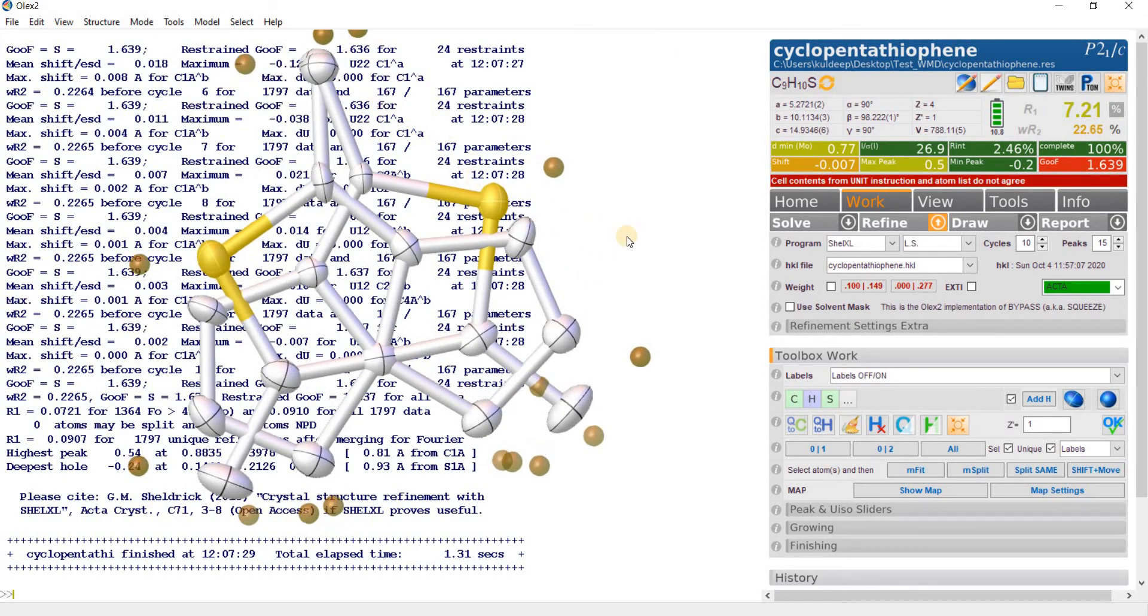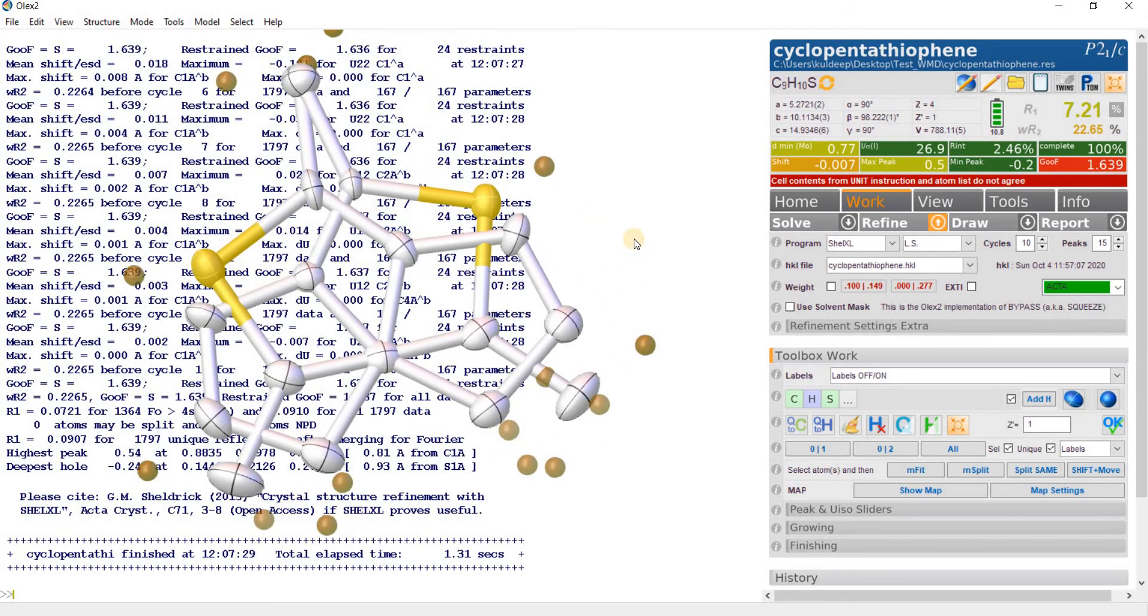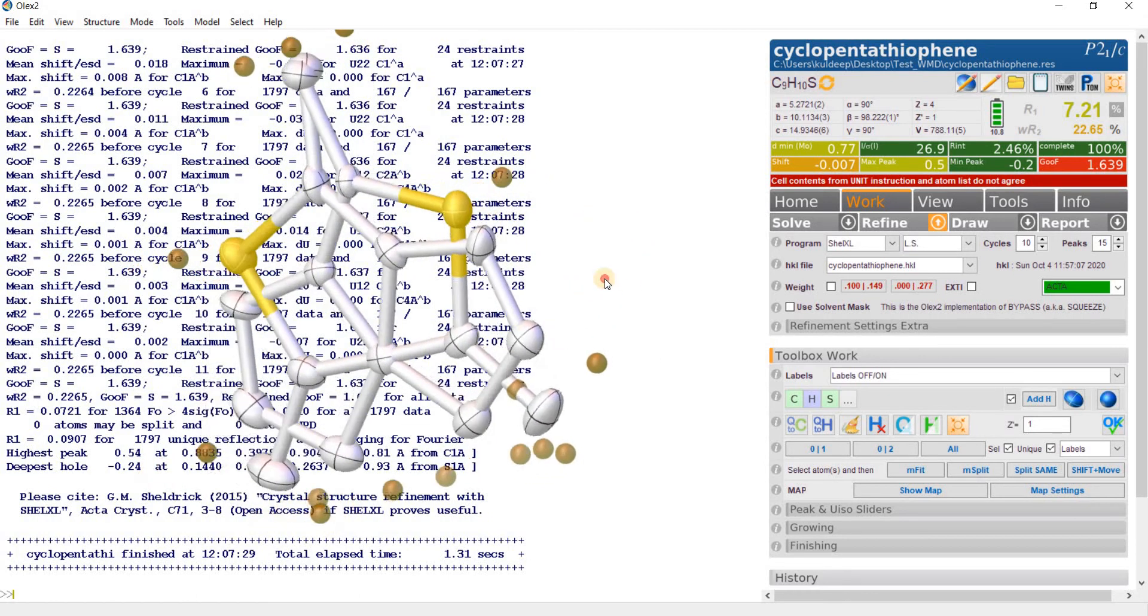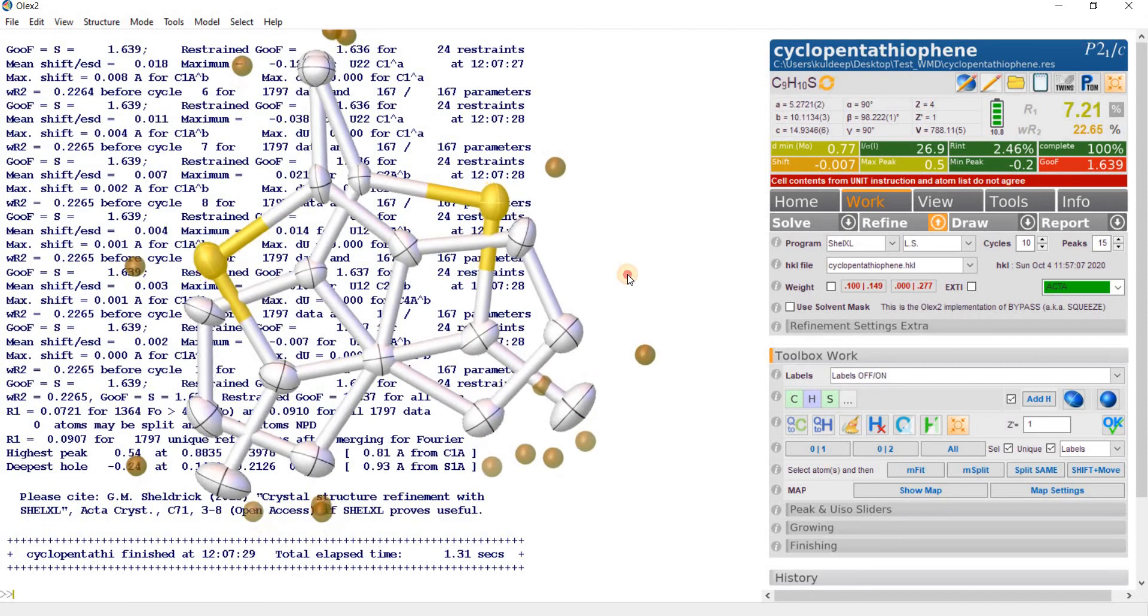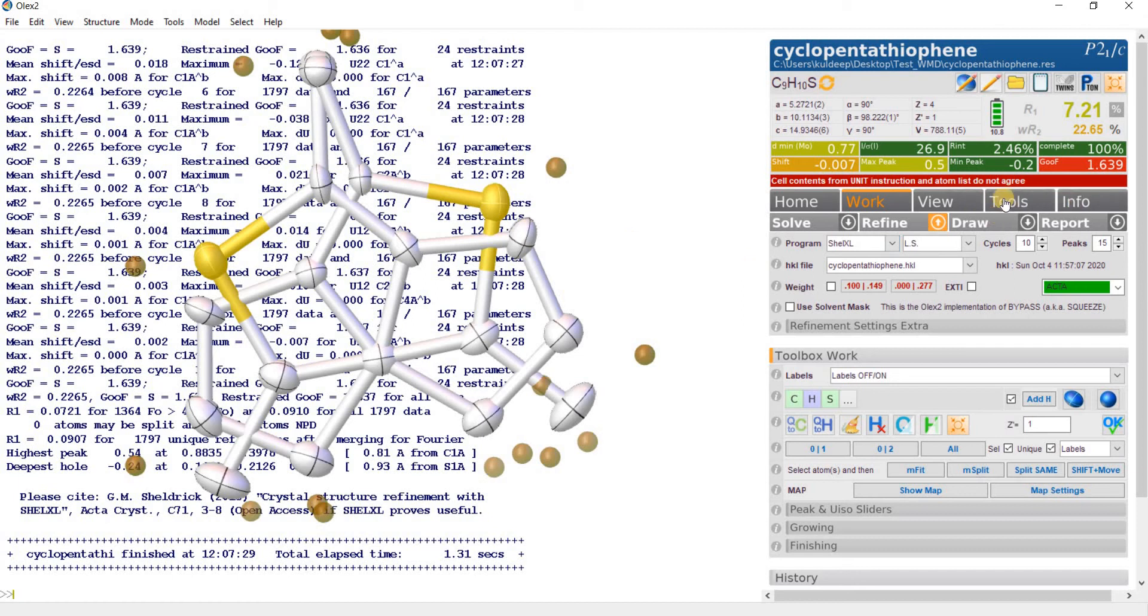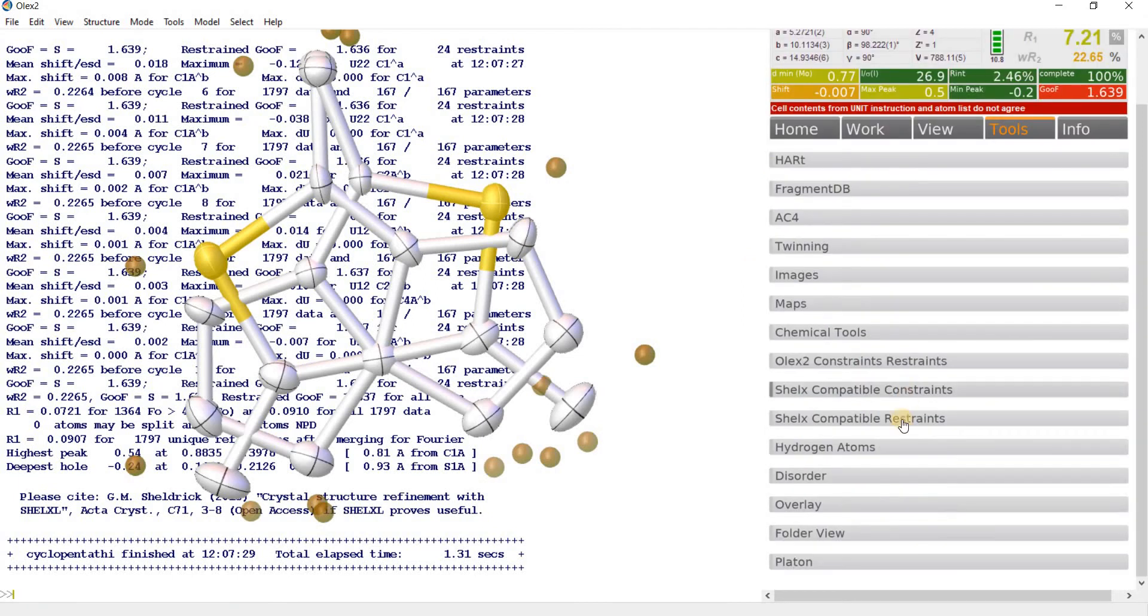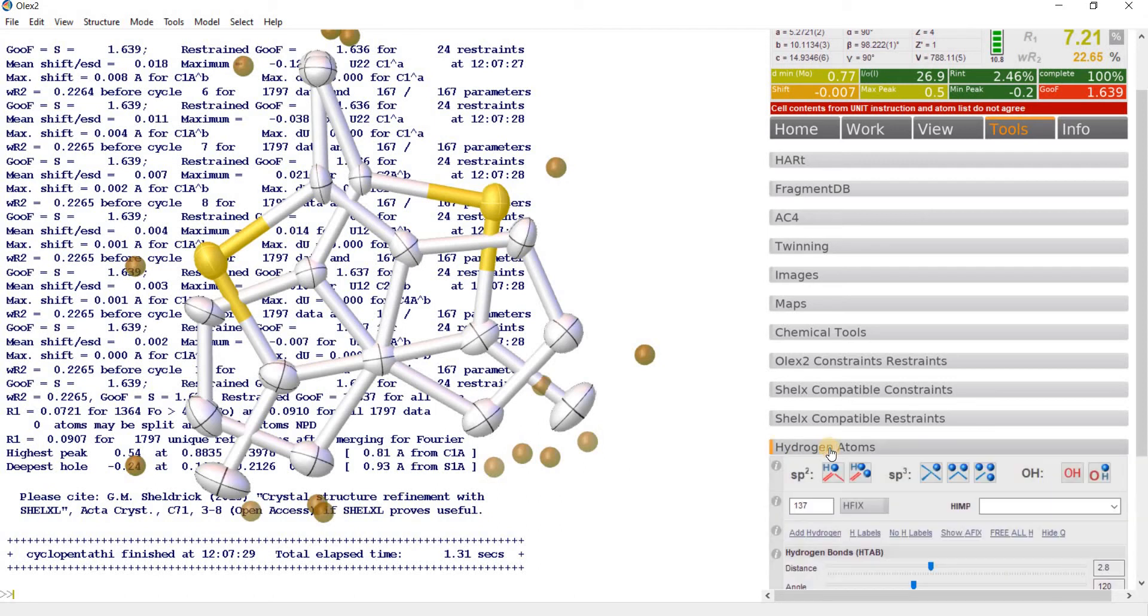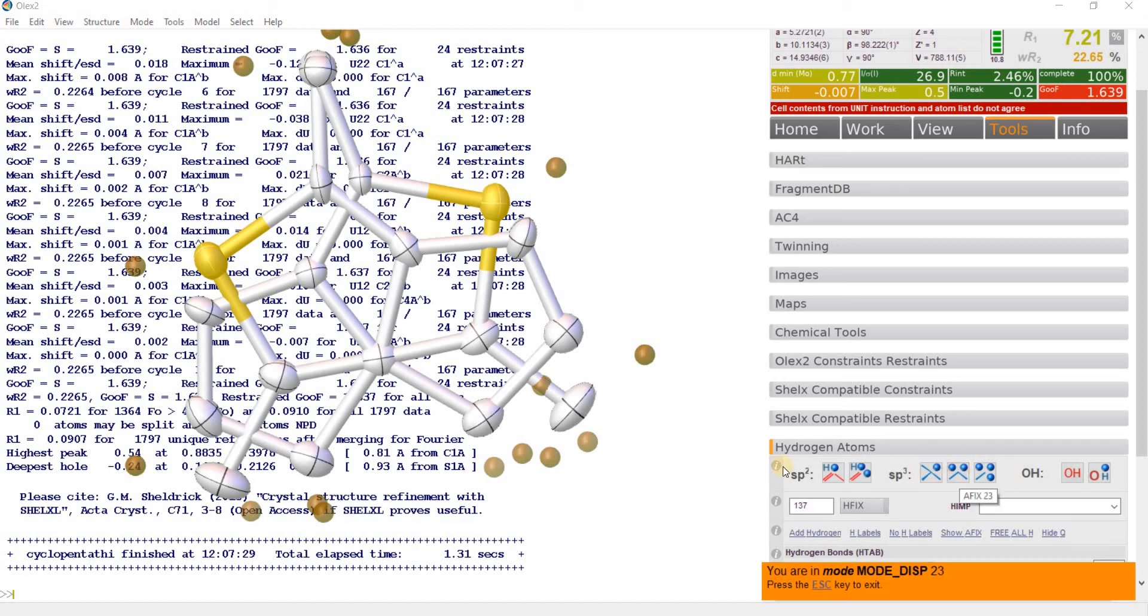Next step is to refine the molecule anisotropically. For this you can press this button directly, or press Control+R, or go to model. It will refine the atoms anisotropically. The R-factor dropped to 7.13. Let's refine one more time. The molecule is appearing quite reasonable. These two thermals seem to be merging with each other. Select the atoms and EADP, equal atomic displacement parameter, enter, and refine.